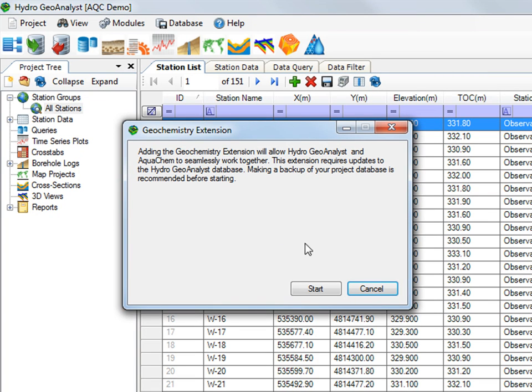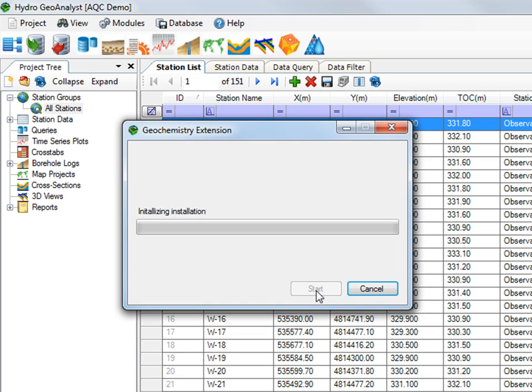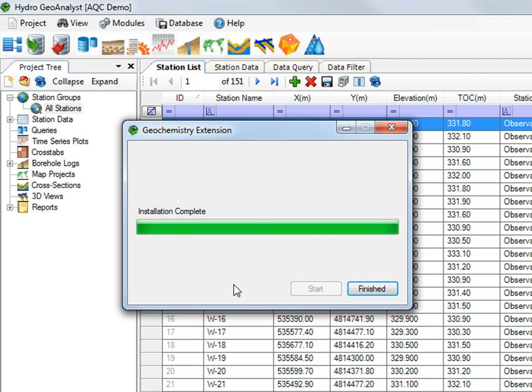What this means is that we are going to add all of the tables and fields required for AquaChem to run on your HGA SQL database. This means that this AquaChem project will not have a separate file.